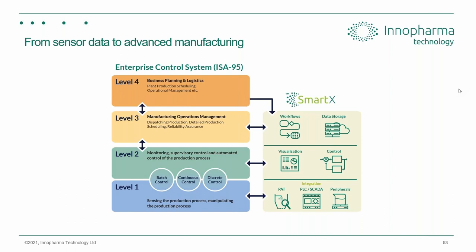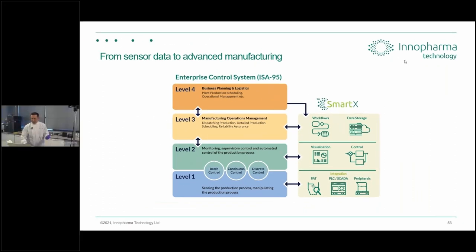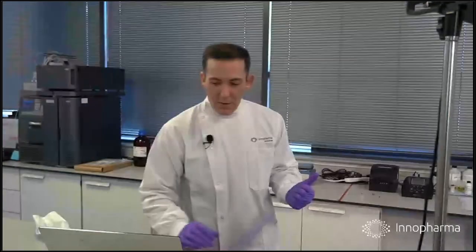Okay, so now we're at a bit of a crossroads here, because Kieran has now prepared the data for us to look at. So we'll look at that data first, and then we'll let Kieran start emptying the reactor vessel and finding out what our yield was. So we'll make the prediction first and then take a look at the yield. I'm going to switch from the presentation now. Okay.